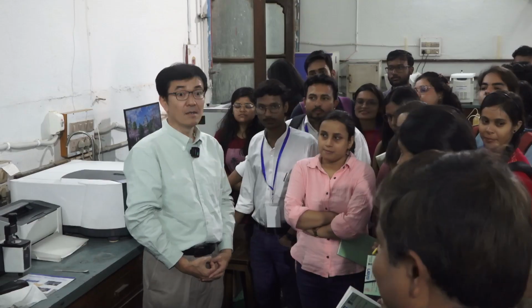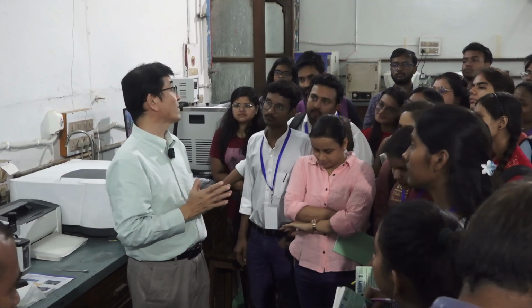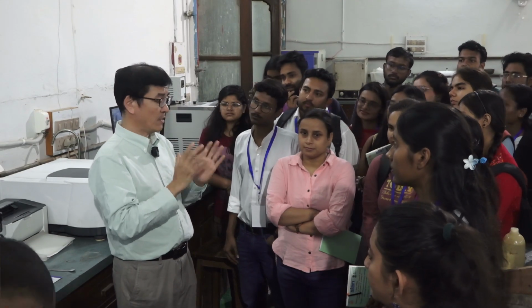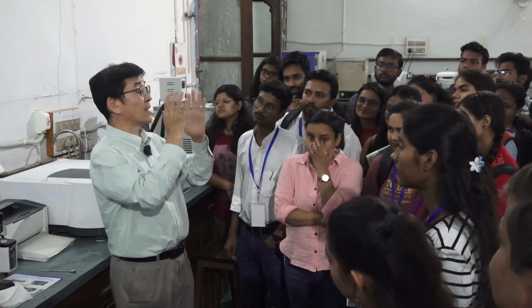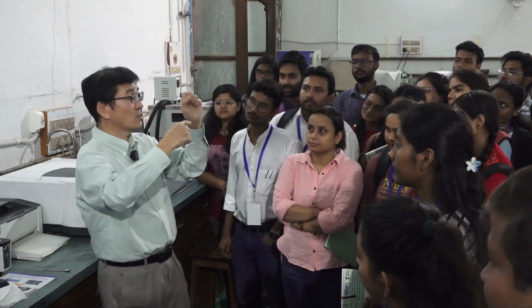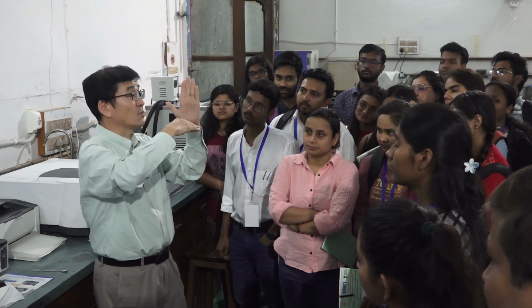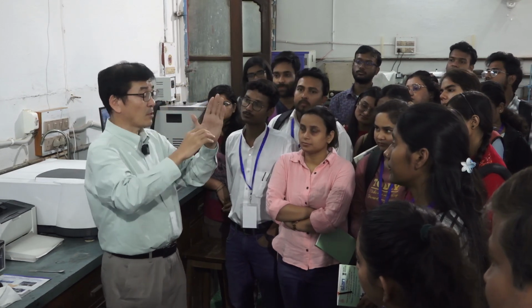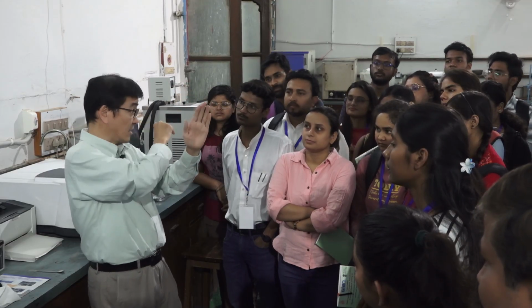Okay, so this is an in-hand training of FTIR spectroscopy. You know, IR spectroscopy is one of the vibrational spectroscopies. We put a sample in the spectrometer and irradiate an IR beam, then the molecule absorbs, and the vibrational energy level is promoted to an upper level from V0 to V1. Corresponding to that event, the intensity of the IR light decreases.